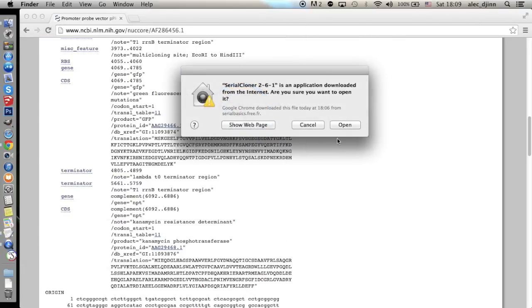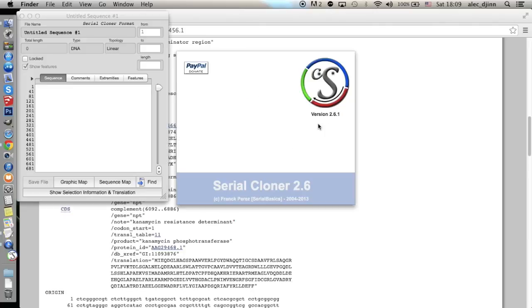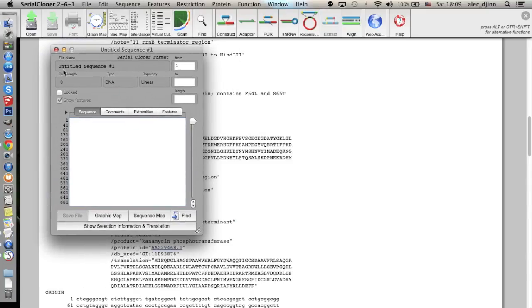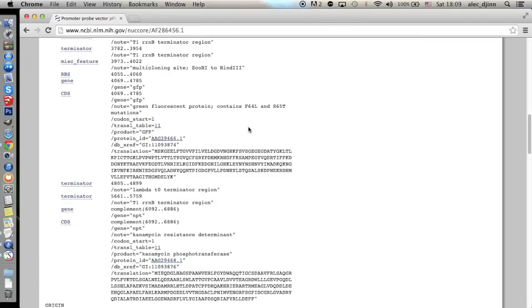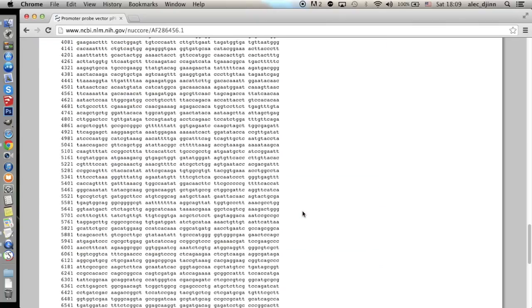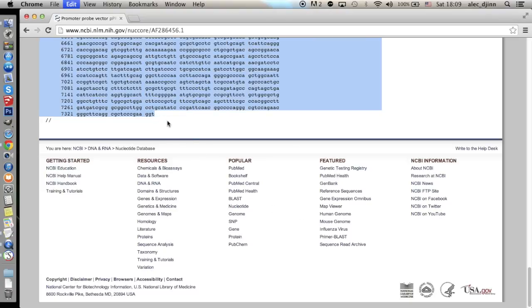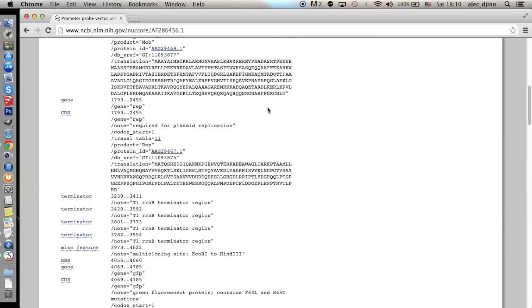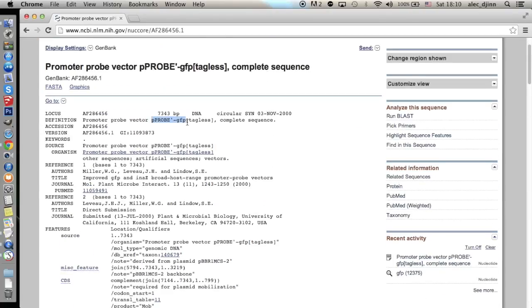At this point, we can open Serial Cloner. When the program opens up, it shows two main areas: the functions panel and the sequence window, which for now is still empty. What we want to do is copy the sequence of the whole plasmid and paste it into this area. So we go back to the web page, copy only the sequence, and paste it into the sequence window in Serial Cloner. Note that the program states the sequence is linear, but since we know it belongs to a circular plasmid, we're going to make it circular. To do this, click Sequence from the menu, then Circularize. Now Serial Cloner correctly recognizes the topology as circular. Let's also copy the name of the vector, use this information to name our file, and save it.